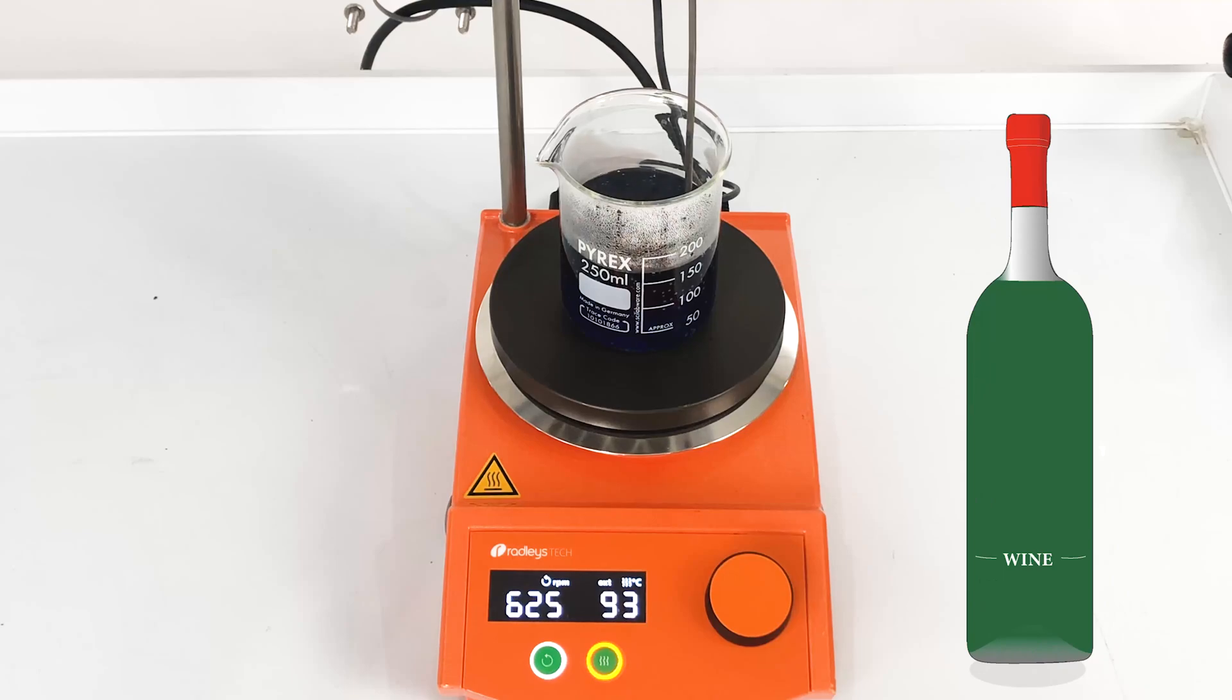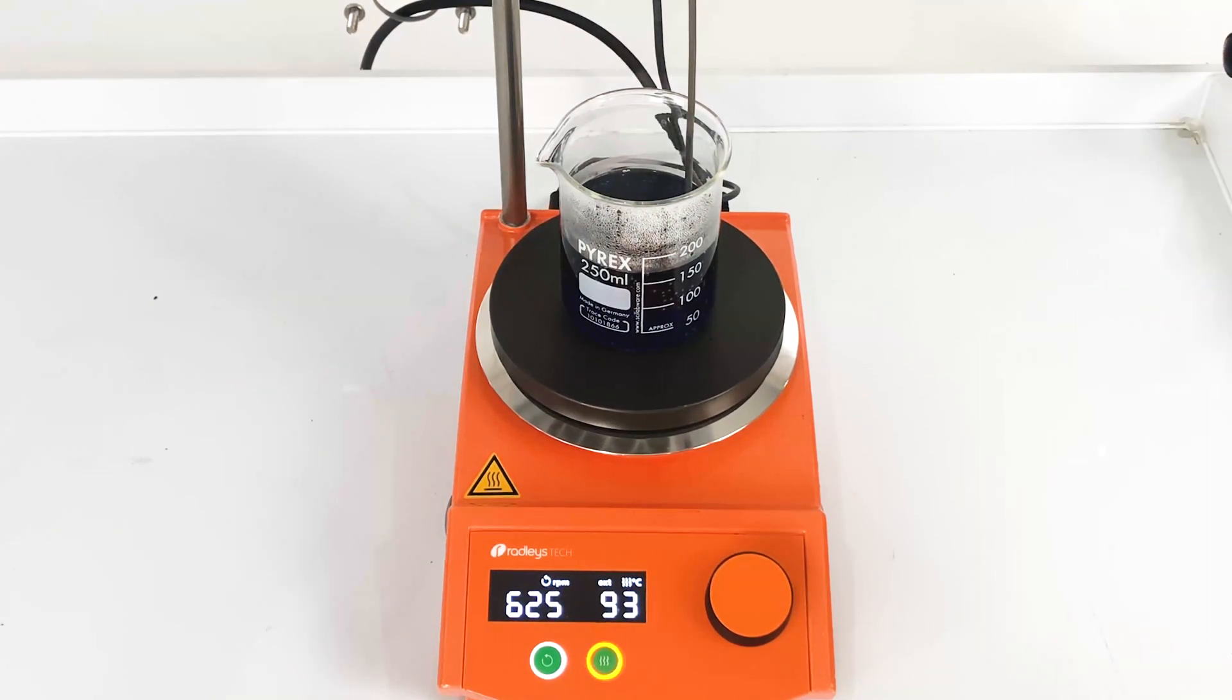This is great when you're trying to make a red wine reduction for your dinner, but not when you're conducting a chemical reaction. So to stop the vapor from evaporating into the atmosphere, we need to incorporate a cool surface so that the vapor can condense.